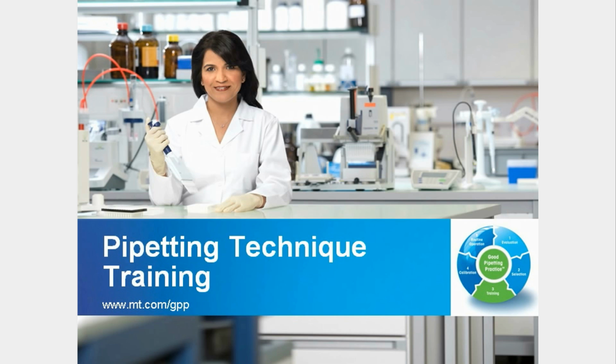Good Pipetting Practice covers a number of individual components that can be considered individually, but when taken as a whole will lead to improved data generation. Today, we just talked about good pipetting technique, but there is a lot more to pipetting than just that, which we would also be glad to tell you about.